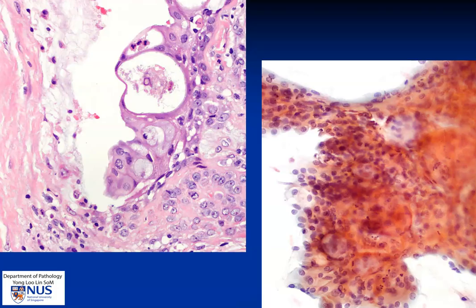Here is a side-by-side comparison of histology and cytology. On the cytologic picture we have cells with denser cytoplasm and these very prominent goblets or mucin vacuoles, which correspond to these goblet cells on histology.